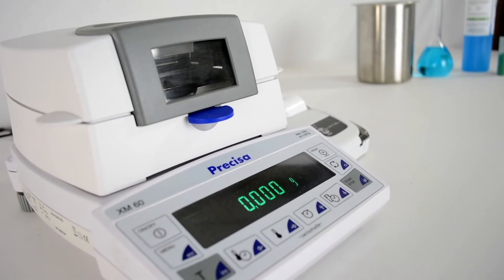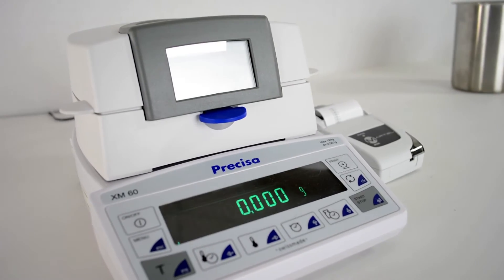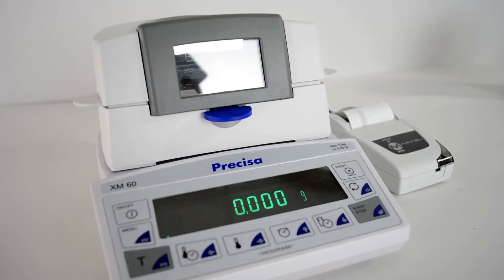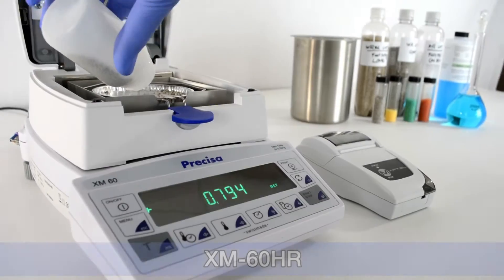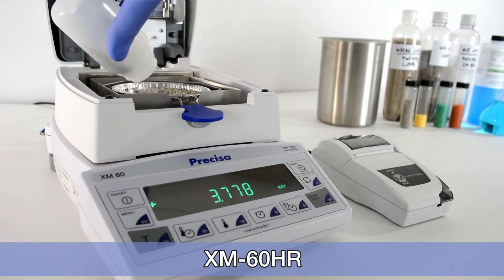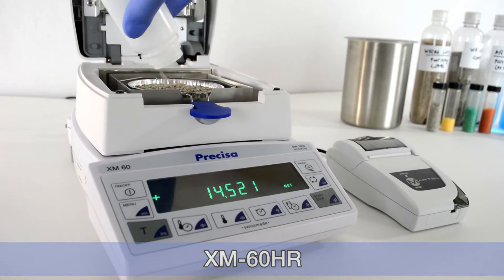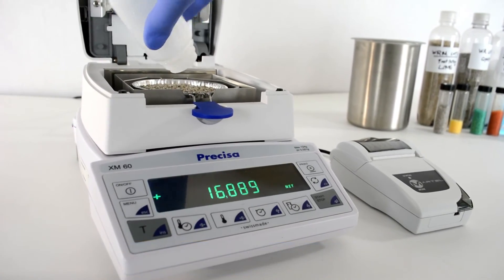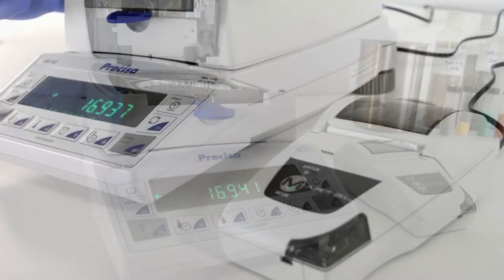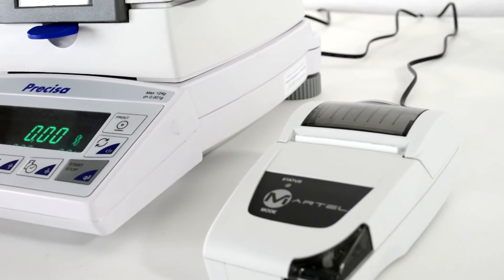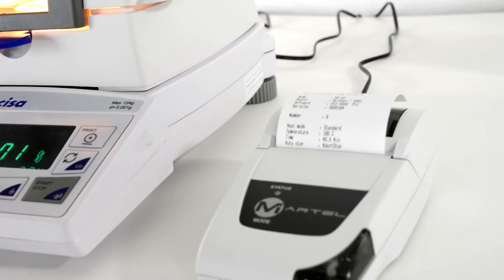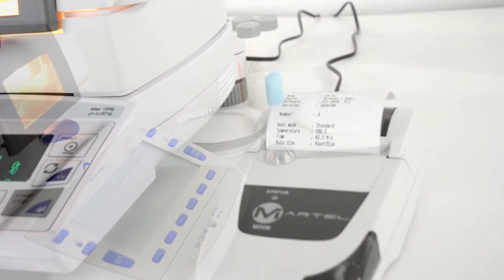Precisa has a full range of moisture balances to meet most application needs. The XM60HR provides simple operation, flexibility, and built-in report printing, while still providing the highest resolution needed for tough applications like plastic pellets.